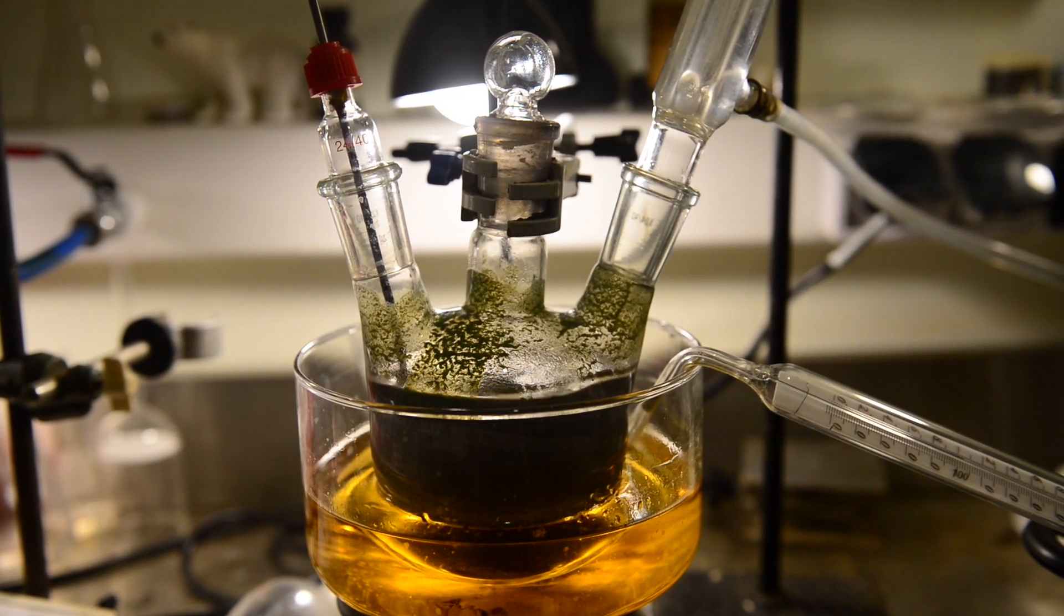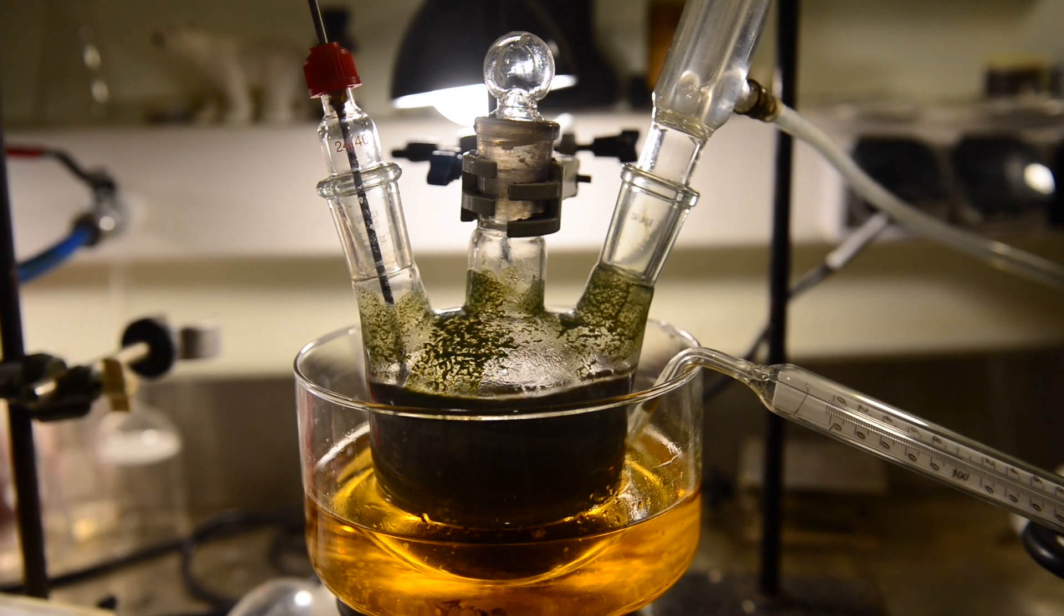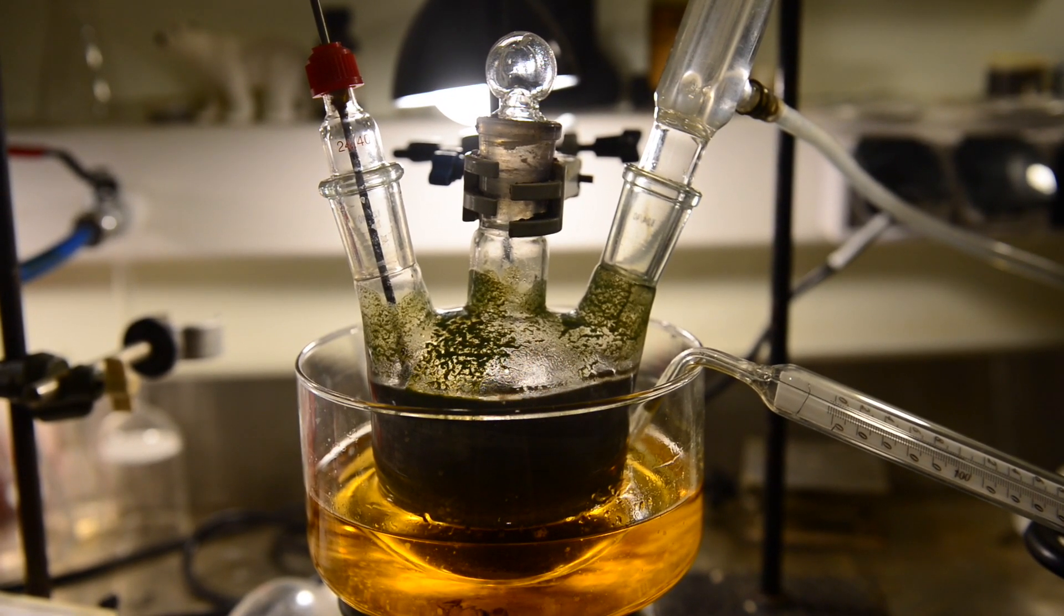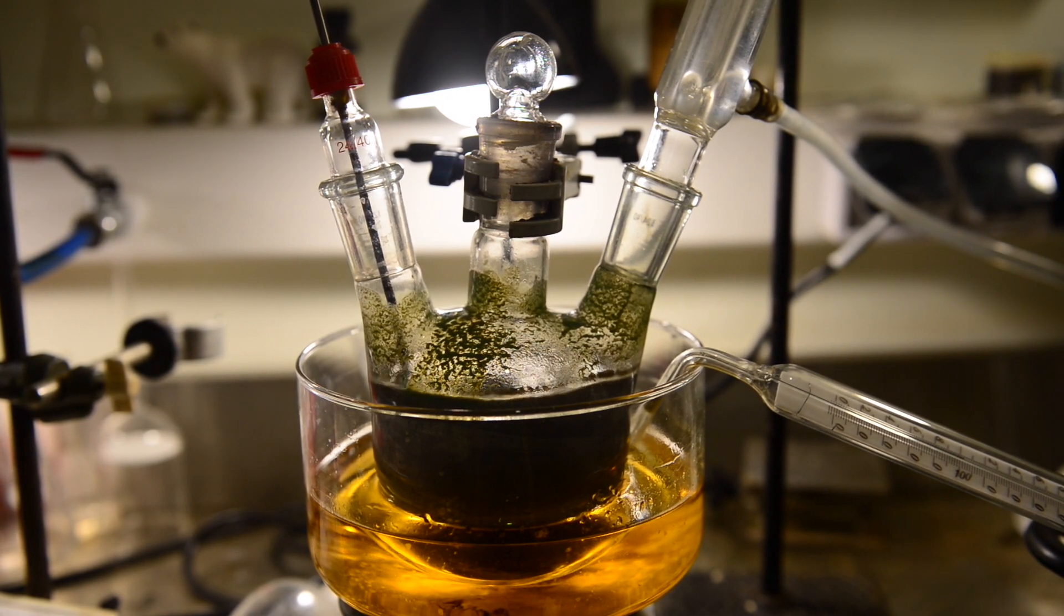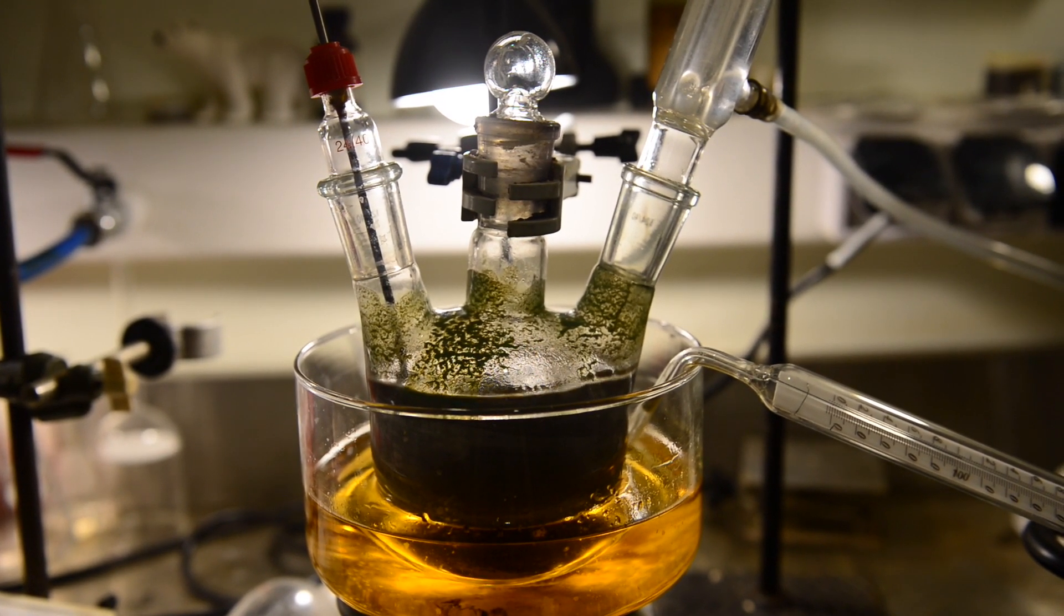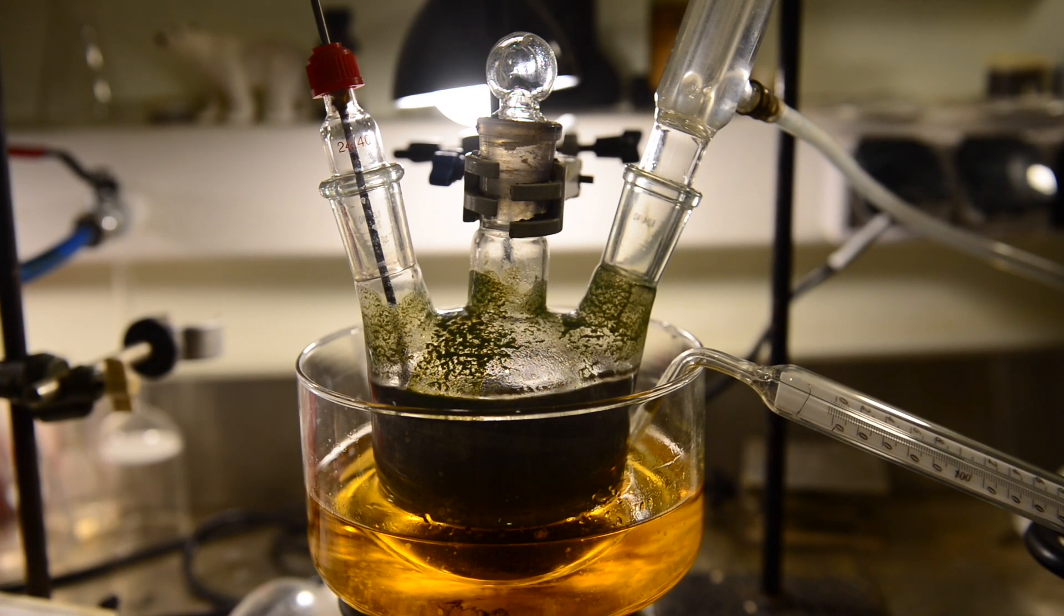After that I change the setup and add condenser on the third neck. At the end of the condenser I connect the same tube going to the window outside. Now I'm going to heat the reaction mixture to 90 degrees Celsius in the course of an hour and then at 100 degrees for another hour. Okay I'm halfway done.